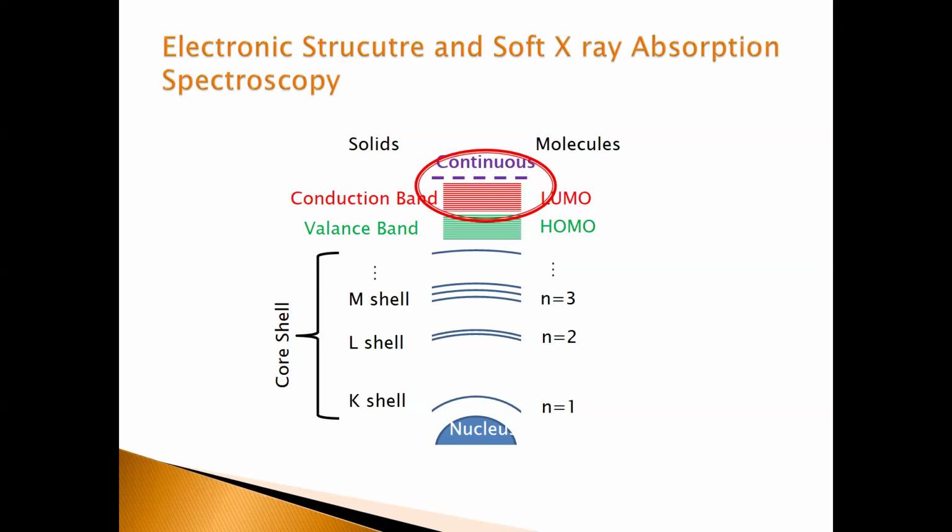We can expose your sample. We can make an X-ray absorption spectroscopy measurement, and during that time, we can make the fluorescence spectroscopy in the visible range.